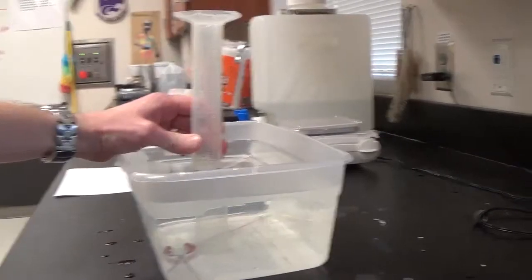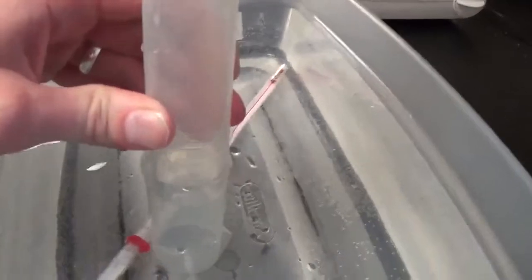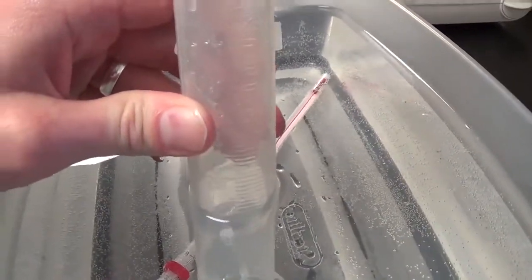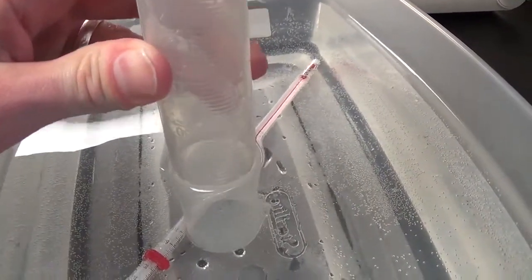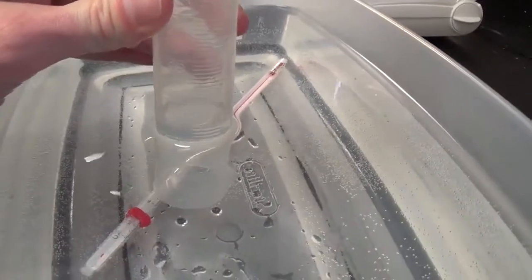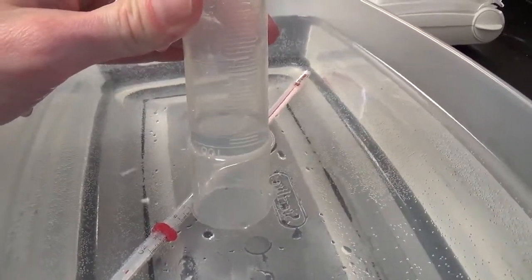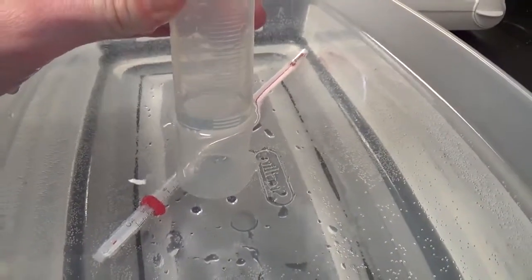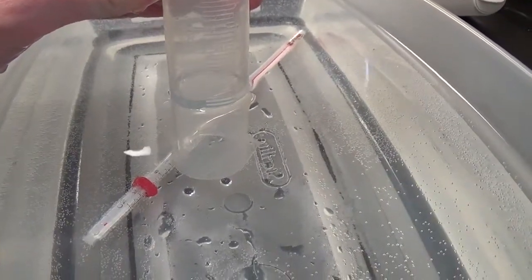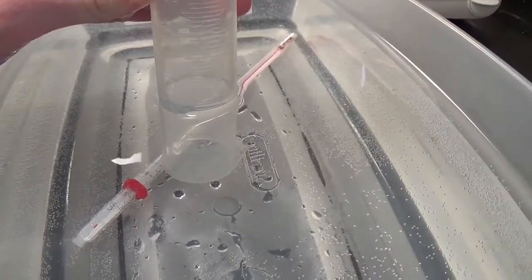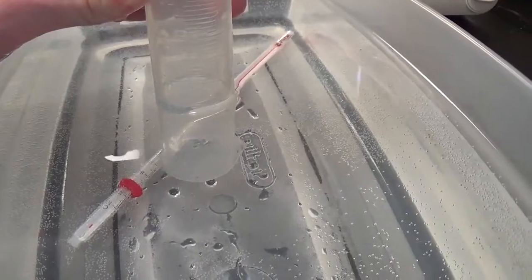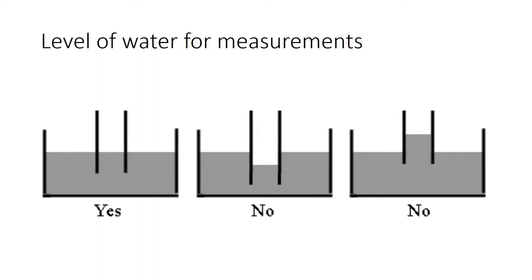It's only necessary that you know exactly what you have, not that it be exactly some specific number. Now you can lift the graduated cylinder up, and you can see that the water level could be a little above or a little below the water level in the tub. You want it exactly the same as the water level in the tub. That guarantees that the pressure is the same.